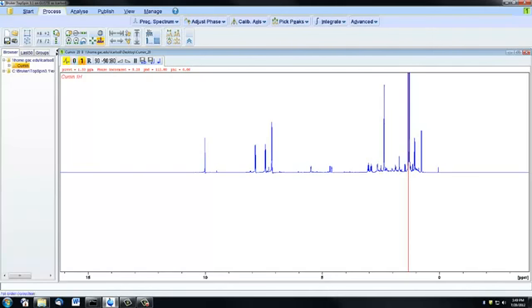and once it looks pretty straight, you can move on to the first order correction, which is going to even out the baseline to the far left of the red line. So you'll see if I move it now, the spectrum is changing on the left side of the screen. So again, you're going to want to try to level out your baseline.